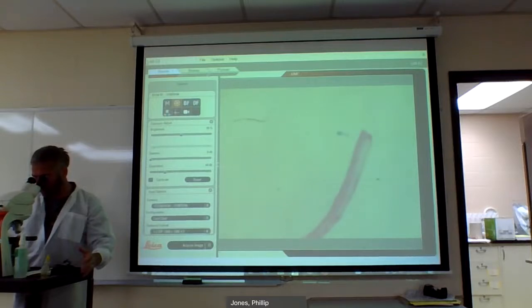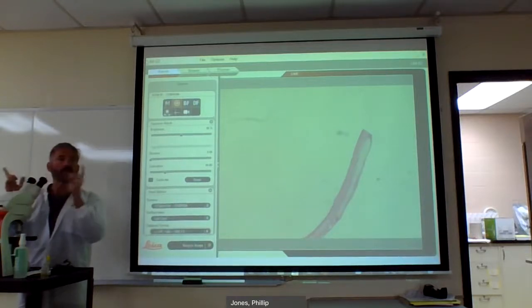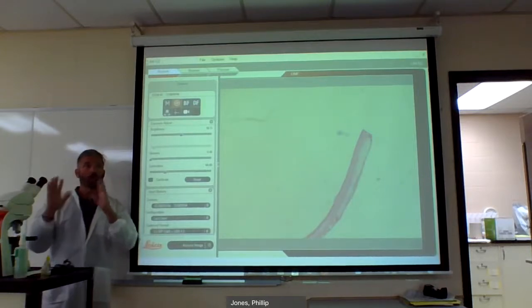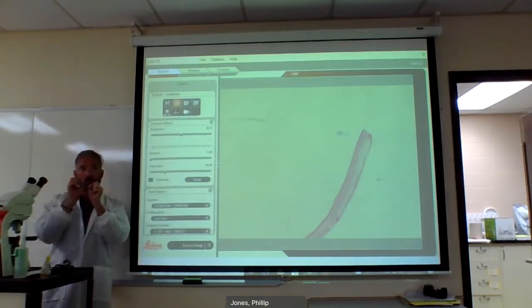I'm going to go and find something interesting with my pointer. I'm on the lateral side. Bringing that in with fine focus — that looks pretty good. The lenses here — everybody has a different PD, which is pupillary distance, so everyone's eyes are a different distance apart. When you're looking at this, you may have to bring the ocular in or out depending on what you want.